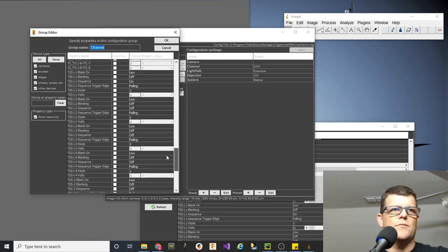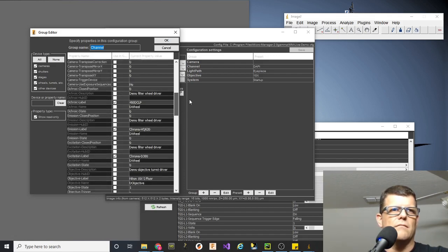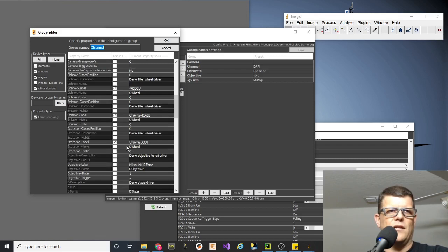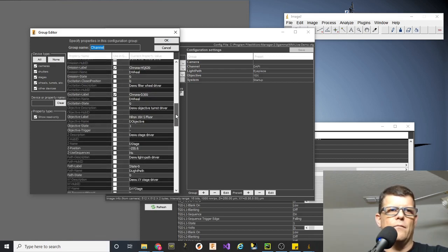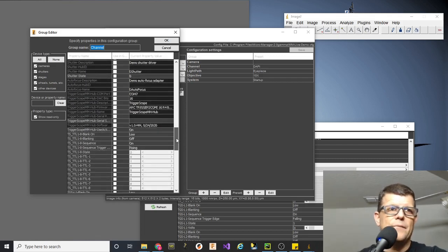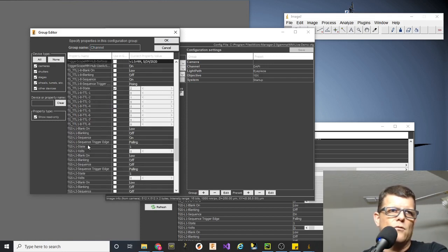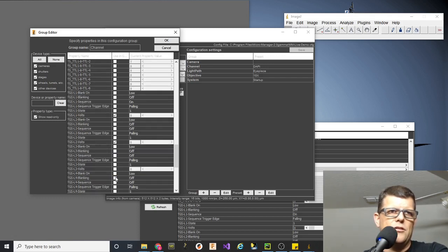I'm going to look at what has been selected. Looks like not much. Okay, the dichroic label, we'll leave that in. Emission label, excitation label, these are already pre-done in the demo. You can imagine if this is a motorized microscope, this is exactly how it would be set up. What I'm going to do here is choose TTL 1 through 8 state, and I'll choose laser 1 power level, so in this case, volts. Laser 2.